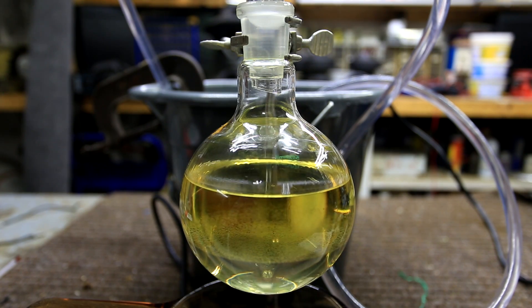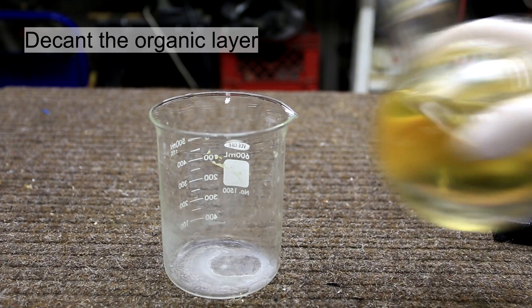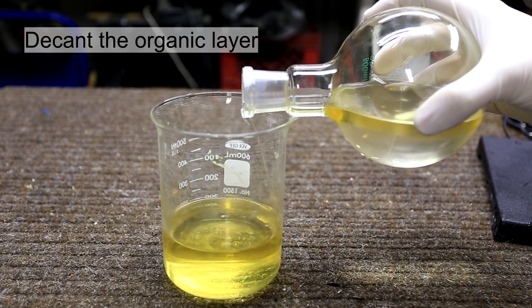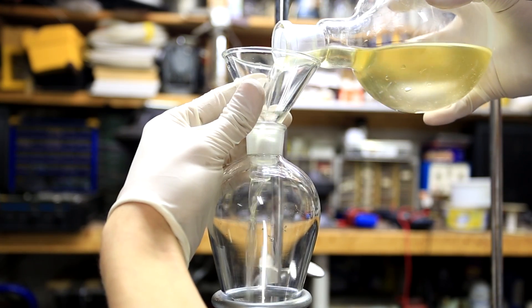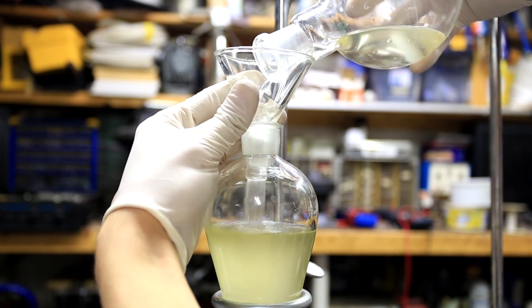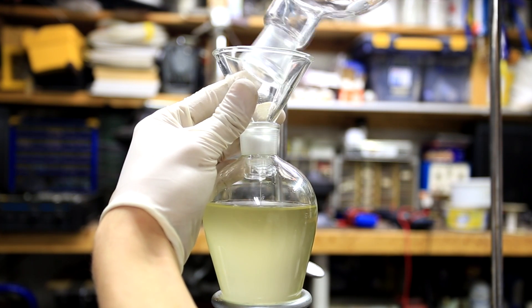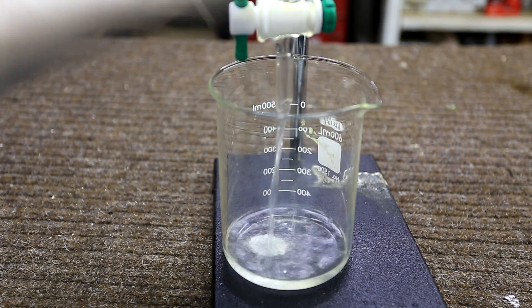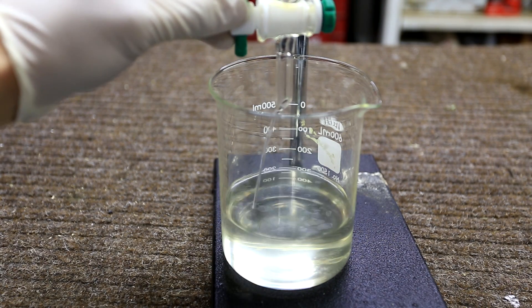After the reflux the reaction flask was allowed to cool and it separated into two layers. The lower aqueous layer contains our desired product, disodium phthalate. We don't need the upper layer so try to decant as much of it as possible without losing any of the aqueous layer. The remainder of the mixture was then transferred to a separatory funnel and allowed to stand to let the layers separate. The aqueous layer might be cloudy but you should wait until it clears up as much as possible, though it may remain slightly cloudy.